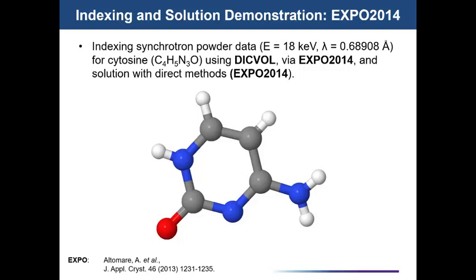So here's our powder pattern. The first step is picking our peaks. So I'm going to go to Pattern and Peaks, and choose these peak search conditions. I'm only going to use the data I need for the indexing here. I'm going to set this minimum 2 theta to 5, just to make sure we don't get spurious peaks at low angle that aren't really there. And I'm going to end the data at about 20 degrees. I'm going to lower this intensity threshold for finding peaks to find as many as I can with the automated routine here. Go down to about 0.5. I'm going to say OK.